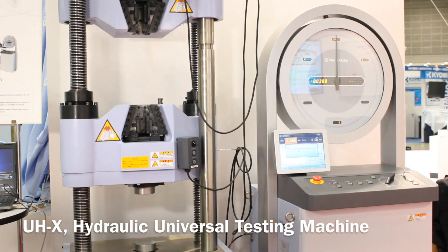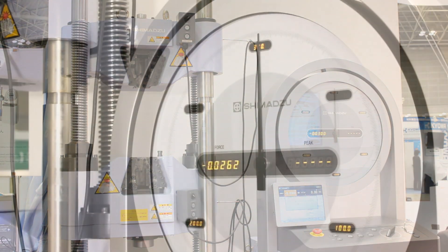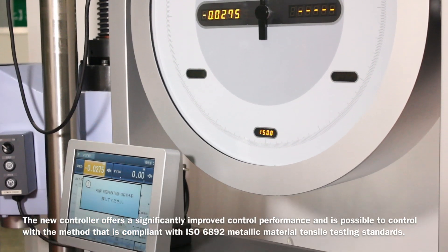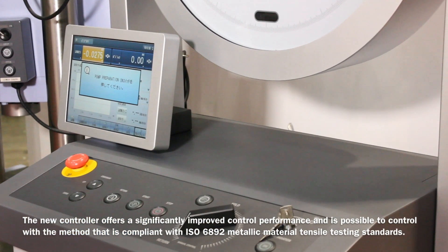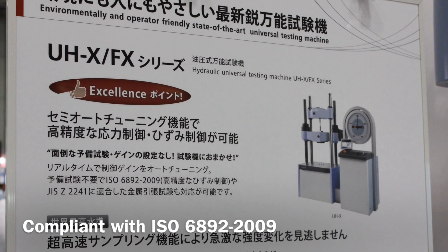The UHX series is the most advanced hydraulic universal testing machine. The new controller offers significantly improved control performance and is capable of control compliant with ISO 6892 metallic material tensile testing standards.